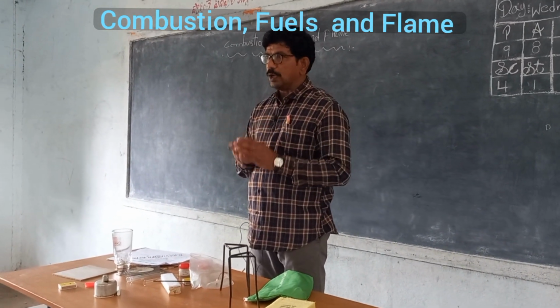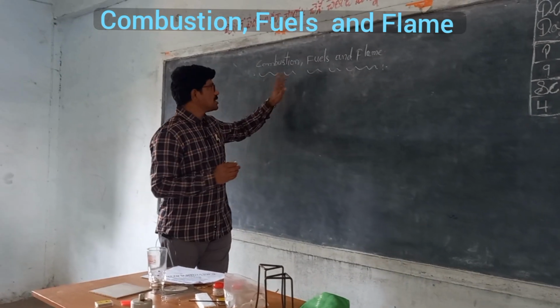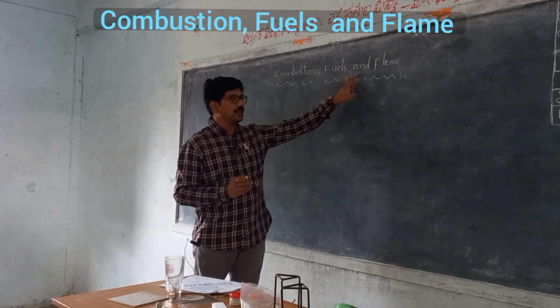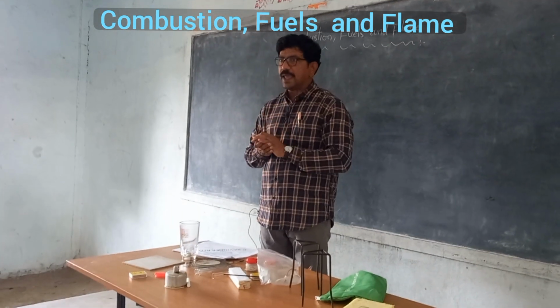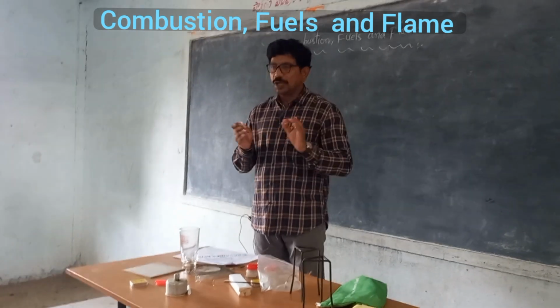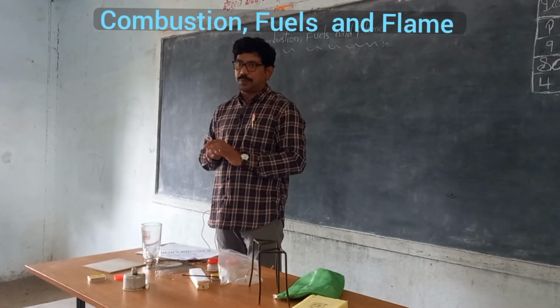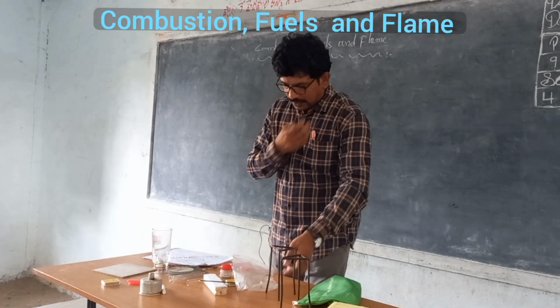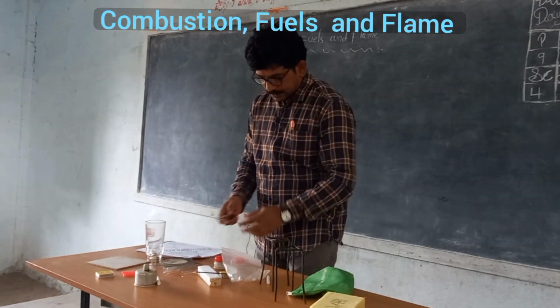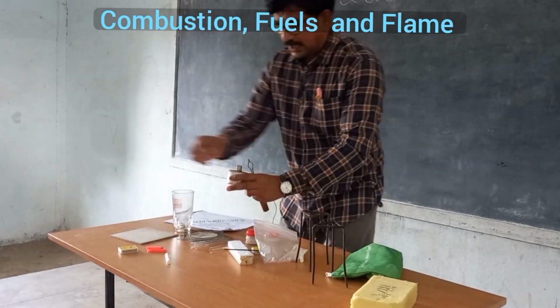Today we are going to learn the lesson combustion, fuels and flame from 8th class, with different activities. As you know, in our olden days we used different materials for cooking purposes. So let us do an activity. See, I have taken the spirit lamp.